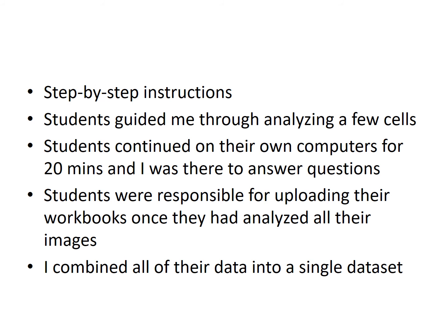Great. Well, how do I enter those data? So it was step by step. I had them tell me what to do. And that really helped figure out where points of confusion might be. So I had them analyze a few cells with me in real time.